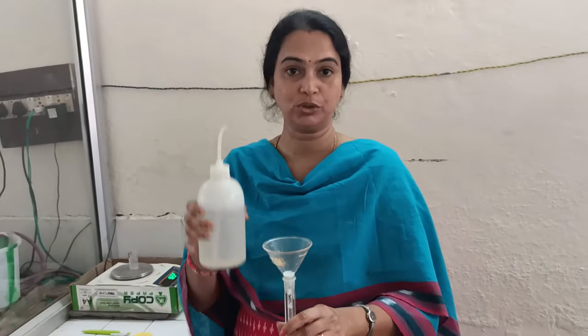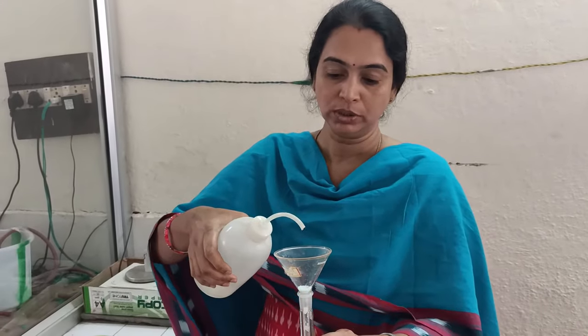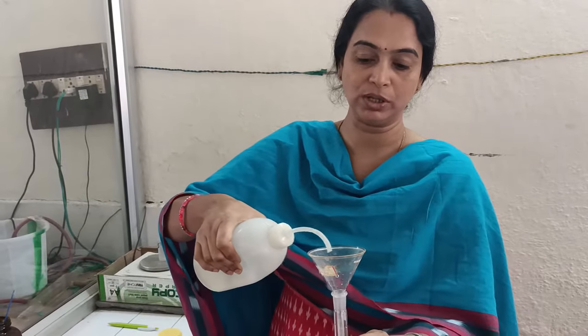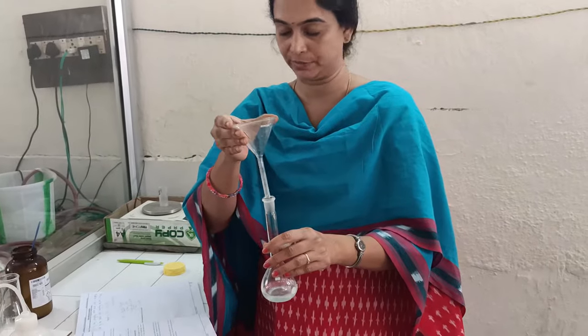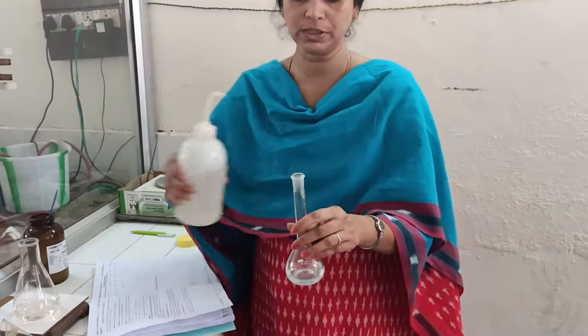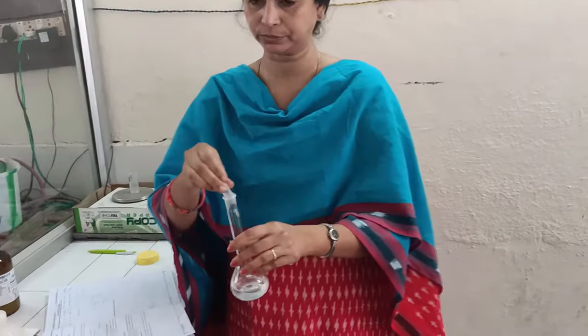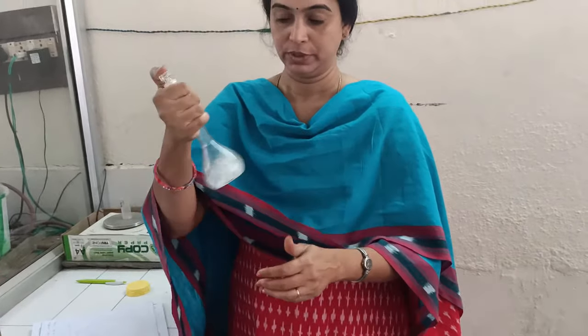This is the wash bottle which contains distilled water. Be careful that you don't add tap water — you must add only distilled water. Transfer a little amount of distilled water and wash the walls of the funnel, because some amount of salt might be sticking to the walls. This ensures the whole amount of salt goes into the standard flask. Then add a little more water and shake it thoroughly so that all the salt gets dissolved.